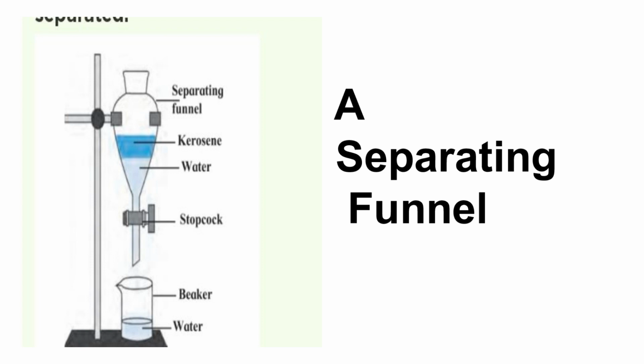And therefore, what happens after this is you open the tap, you run out the water, and place another different container to run out the interface. The interface is normally discarded. Then you will remain with your paraffin in the separating funnel.